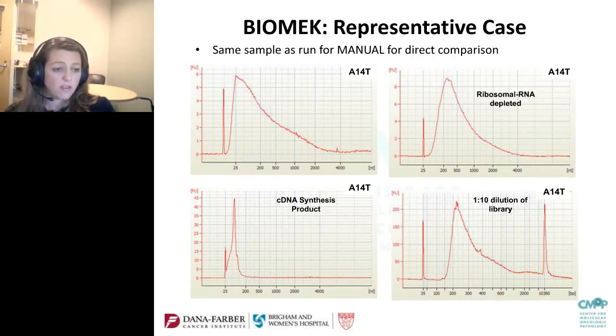Once we saw this, we went ahead with our cohort, which is our 14 pairs, and ran all of these in parallel on the Biomek.